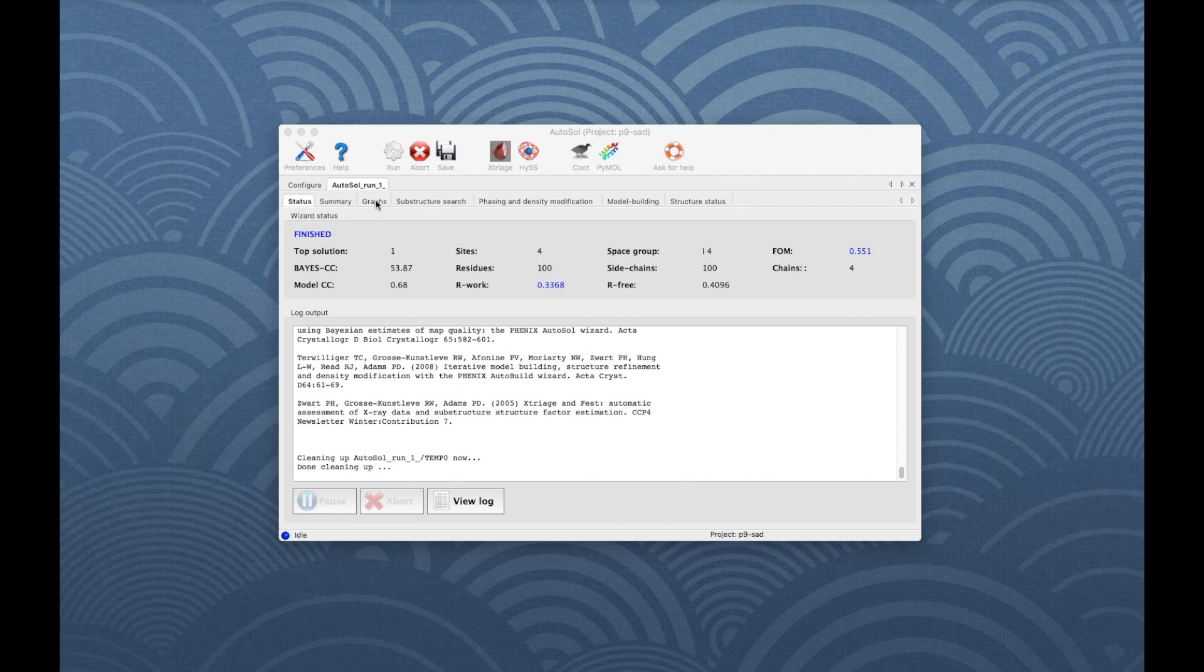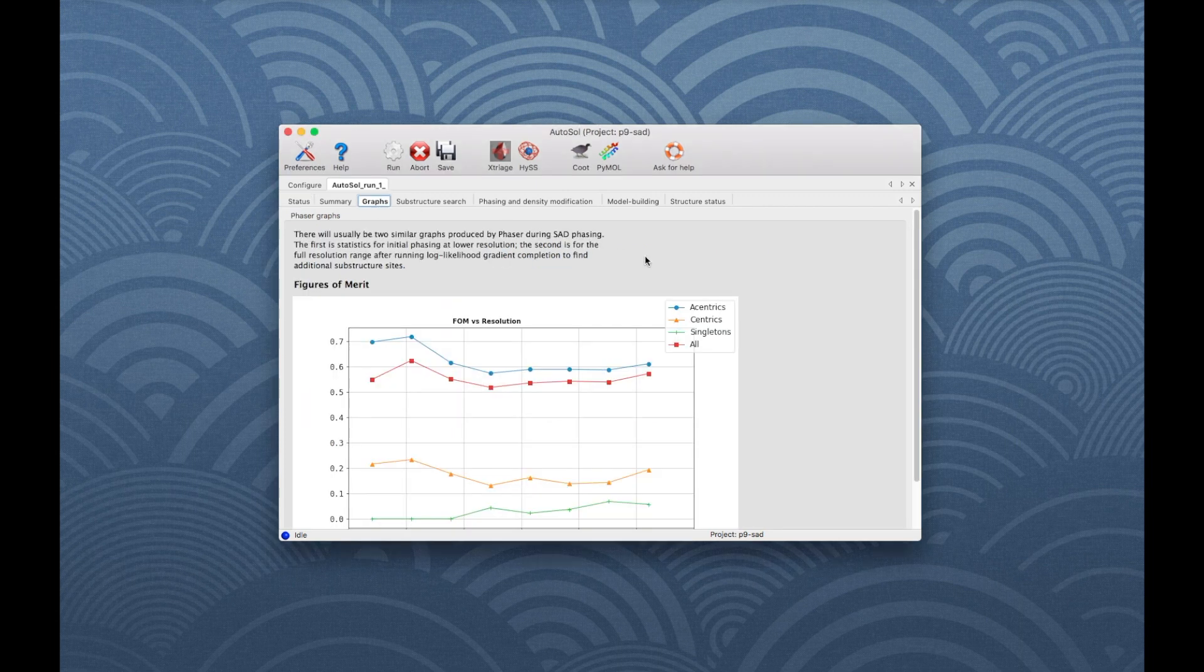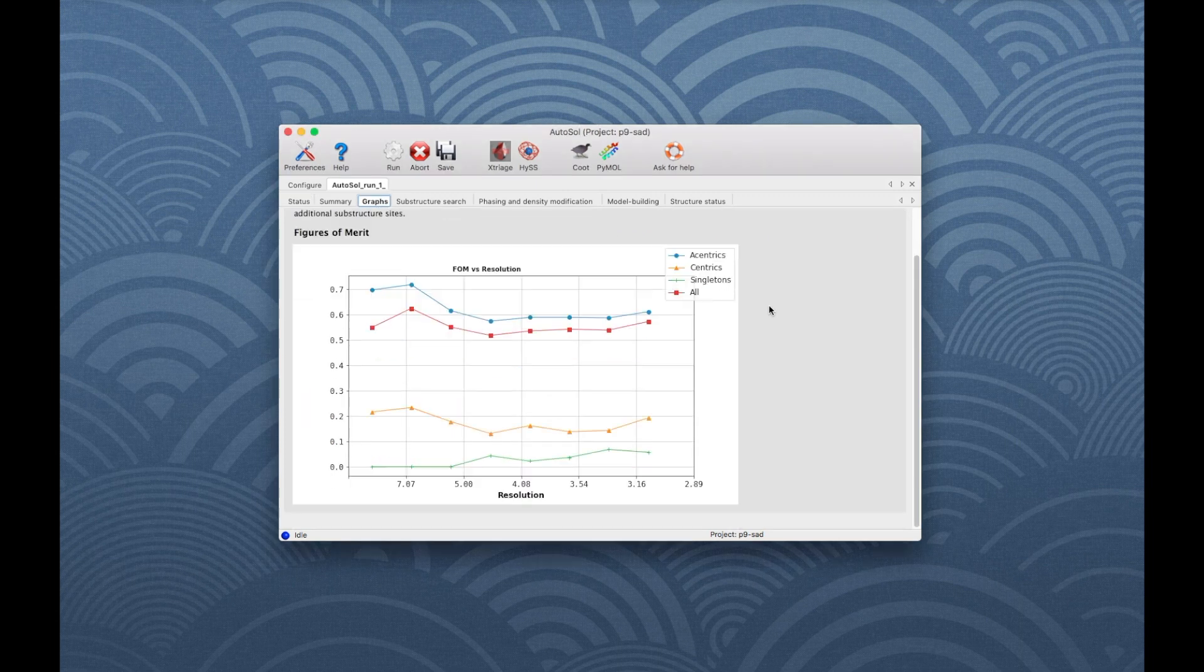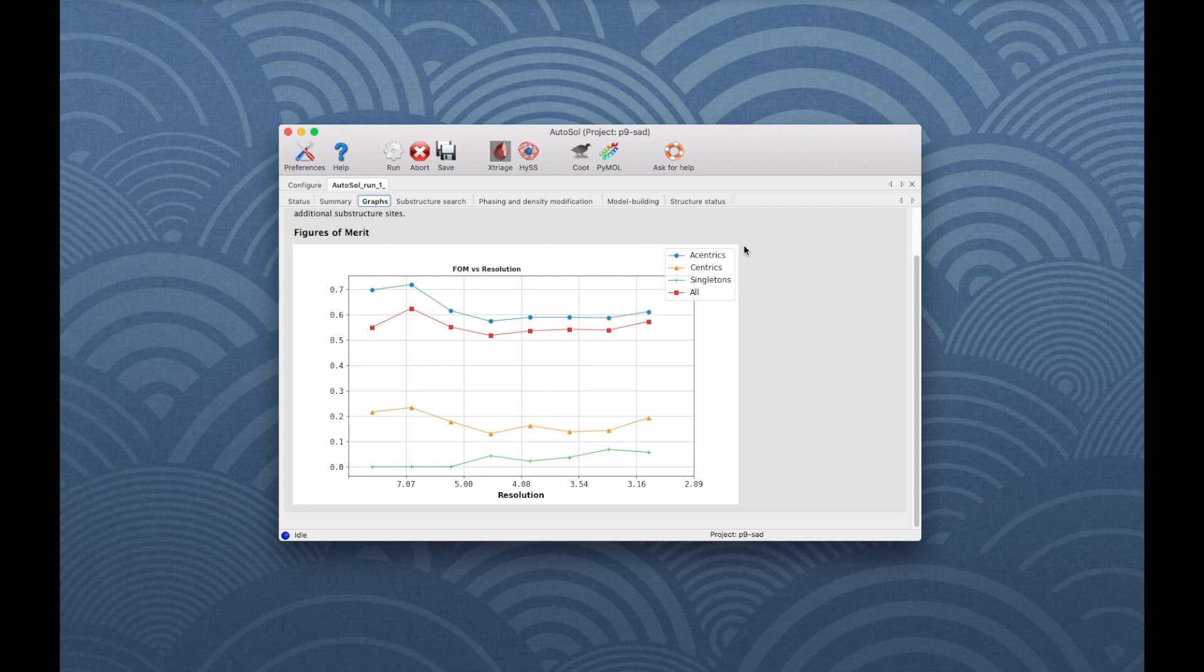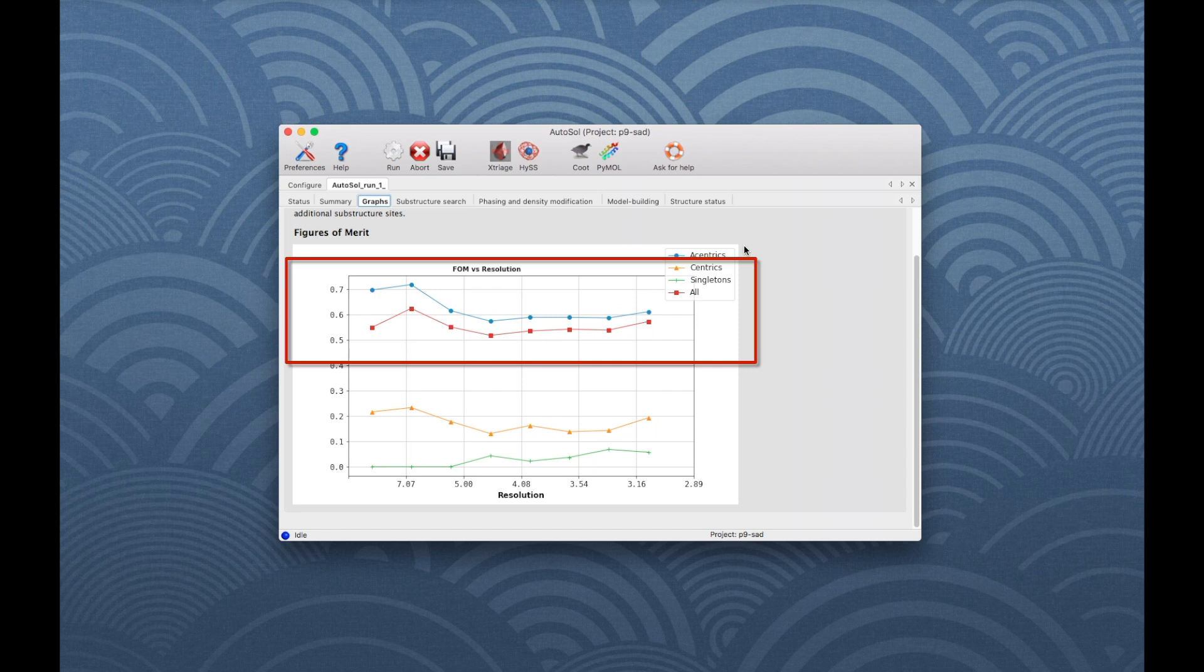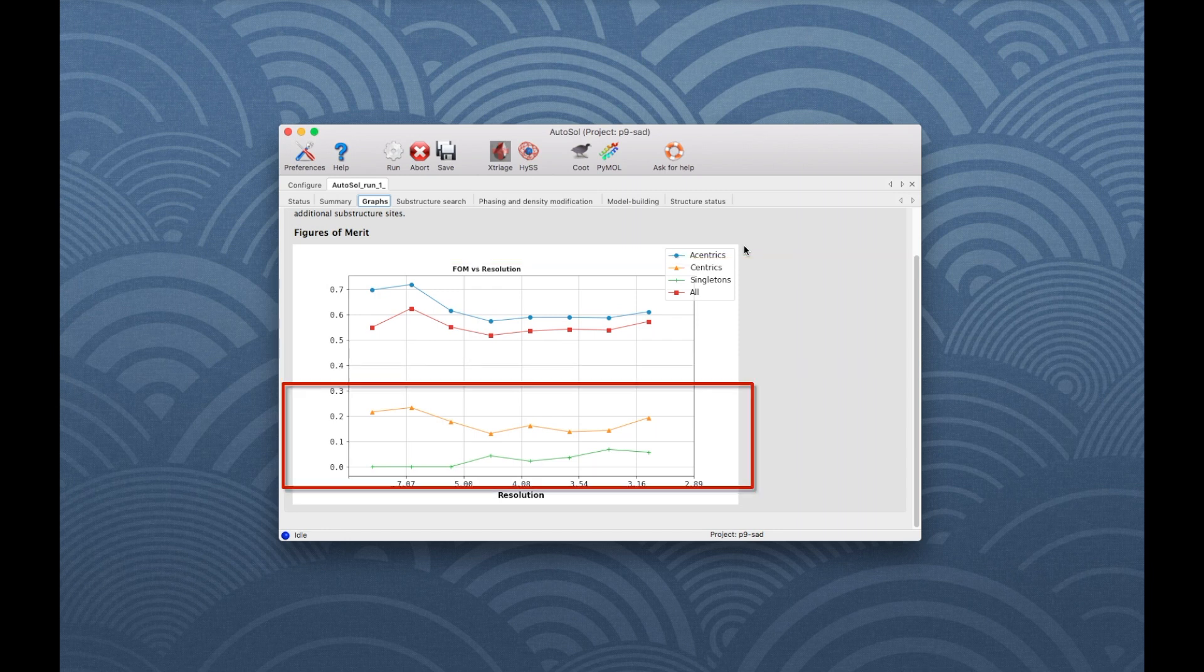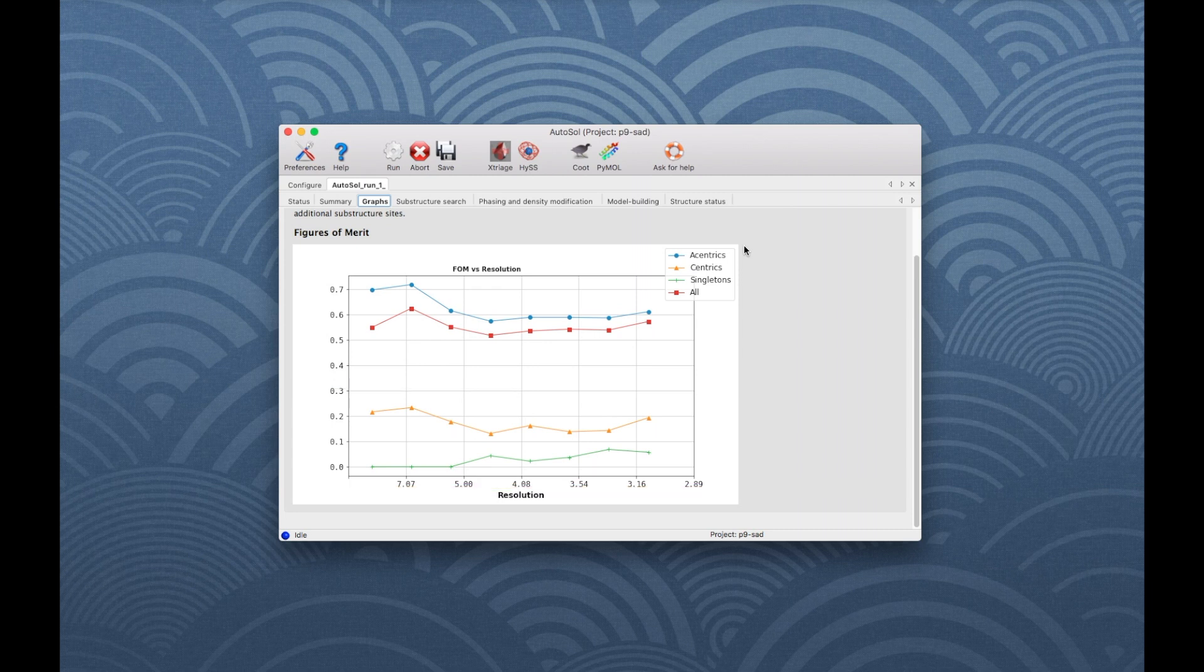The Graphs tab shows the quality of phasing as expressed by Figure of Merit versus Resolution. The Figure of Merit is an estimate of phase quality, ranging from 0 to 1. It normally falls off with resolution. Acentric reflections, which have anomalous differences that yield phase information, have higher figures of merit than centric reflections, which have no anomalous differences.